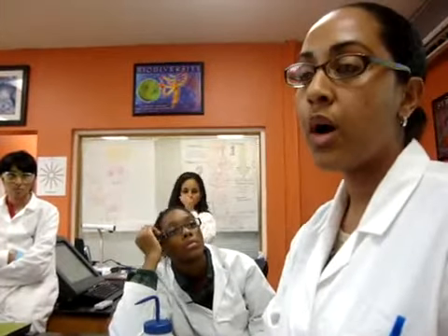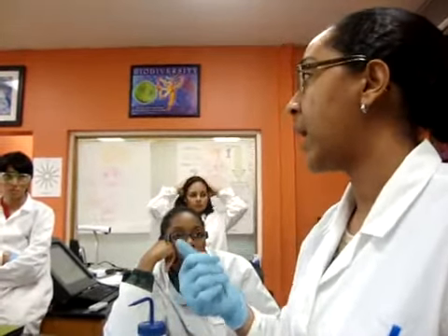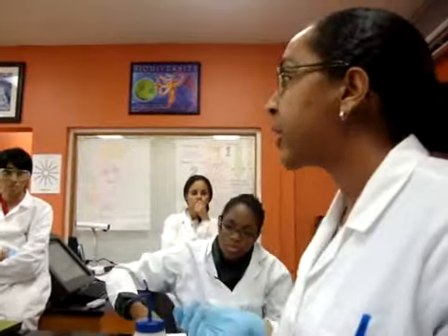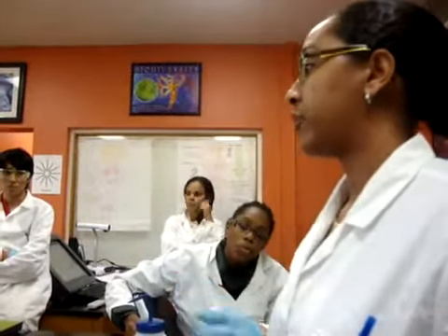Remember, to see bacteria clearly, you need to go all the way up to 100 times, and that's oil immersion. So please do not rotate the ocular to the 100 lens if you don't have oil on your slide. Okay? And at the end, make sure you clean the oil off. The oil does harden onto the lenses, which damages our microscopes. So you've got to get an alcohol swab over at the desk and wipe that oil off before you pack your scope away. Any questions?